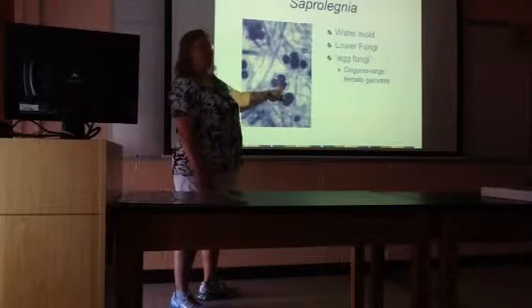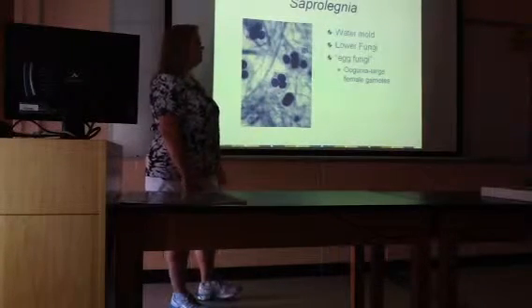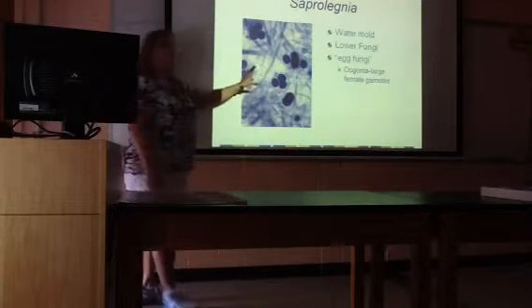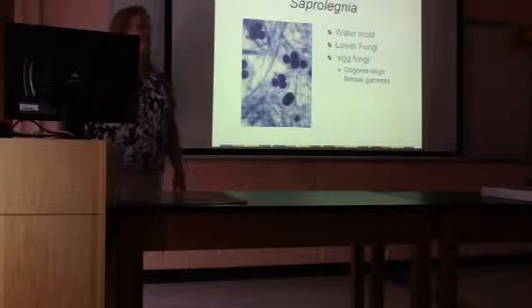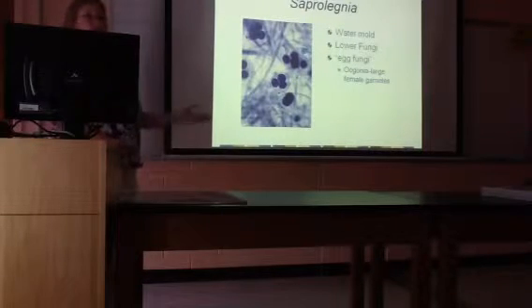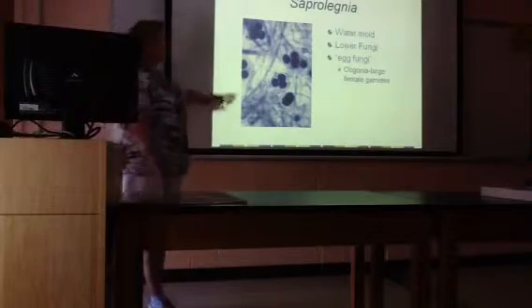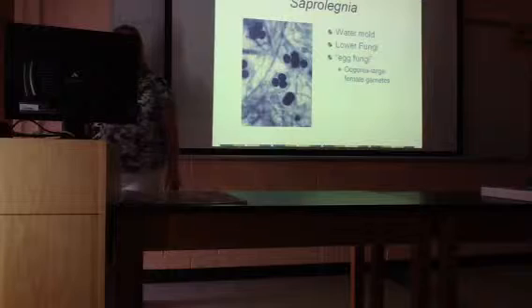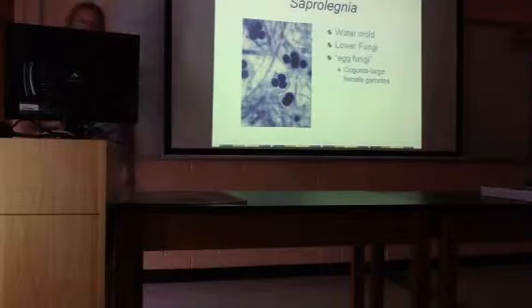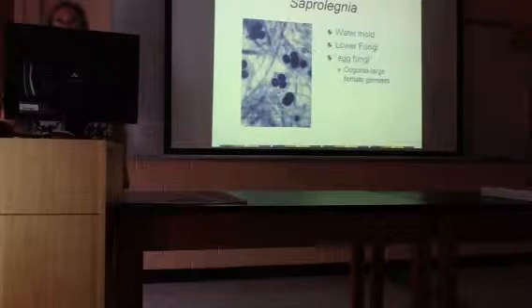These are sort of analogous to eggs. So egg fungi is a common name for them because they look like they've got little sacks of eggs inside. And again, color is not going to help you. Ours aren't blue. Some of our slides are green, some of them are pink. But you're looking for those round structures with the dots inside. No human diseases caused by this one. Questions on that one?